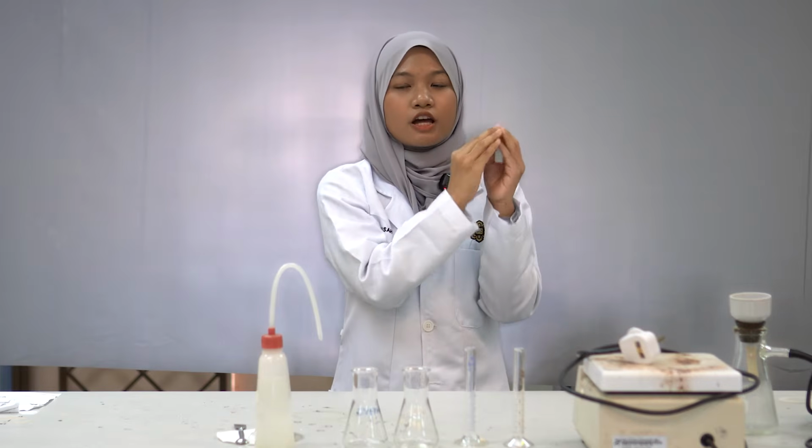Recrystallization is the easiest and most effective way to purify an organic solid. Basically, the idea behind recrystallization is quite simple. When the crystal is formed, only the correct molecules will fit perfectly into the crystal structure, leaving the impurities behind in the solvent.